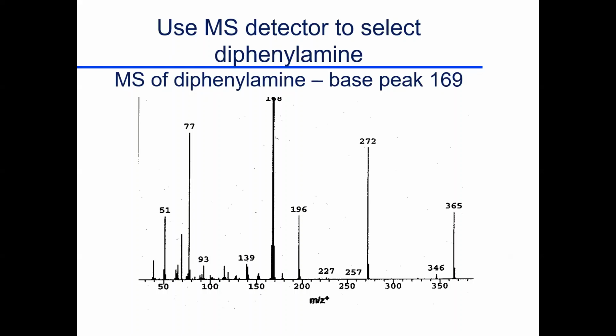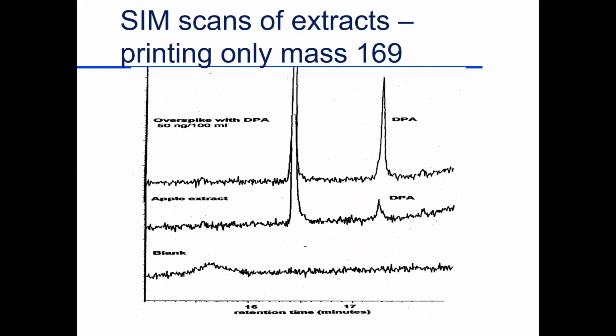That's one way. But another way is to go ahead and use a mass spectrometer, so use an MS as a detector. And so you can make your injection into the GC. You tell your GC that we want to keep looking for this, look every 100 times a second. Let's say you look for this fragmentation pattern, and you can then find that particular compound.